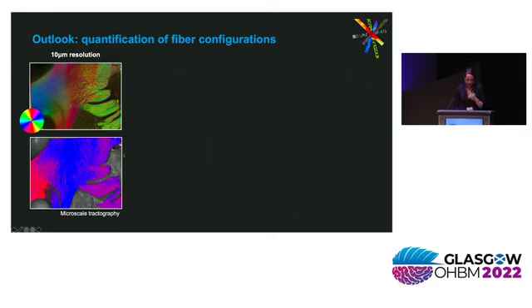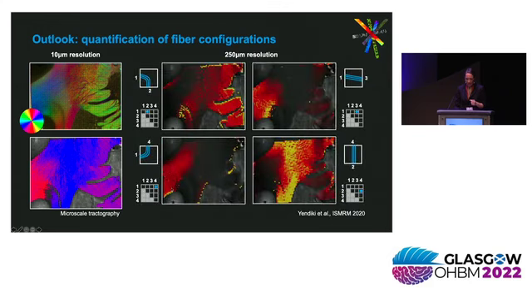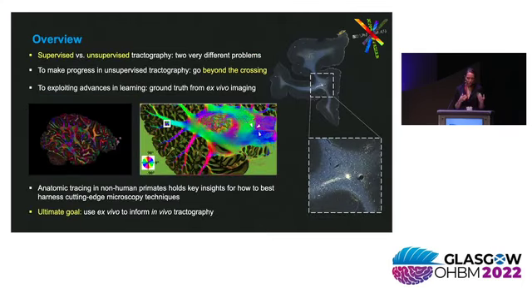One thing that we tried a few years ago was to run tractography on the microscopic orientation vectors from the optical imaging and to quantify the amount of fibers that connect each pair of edges of the diffusion voxel. And we found that this was a parsimonious enough representation, with just a few parameters, that however captured the anatomical detail of this sample. So going forward, this is something that we will be pursuing further, trying to figure out good models that go beyond the crossing fiber.